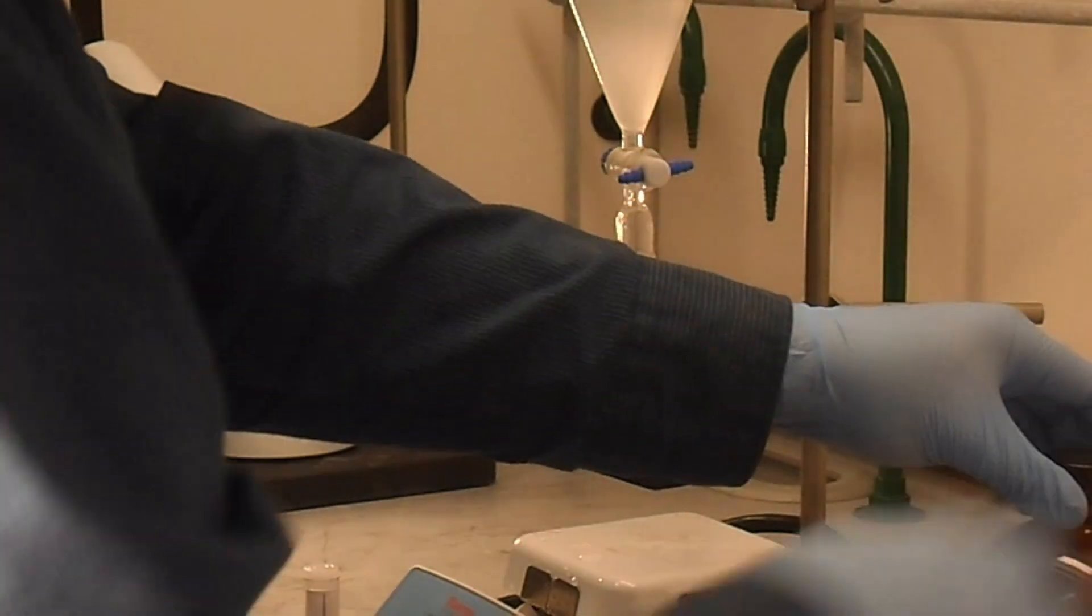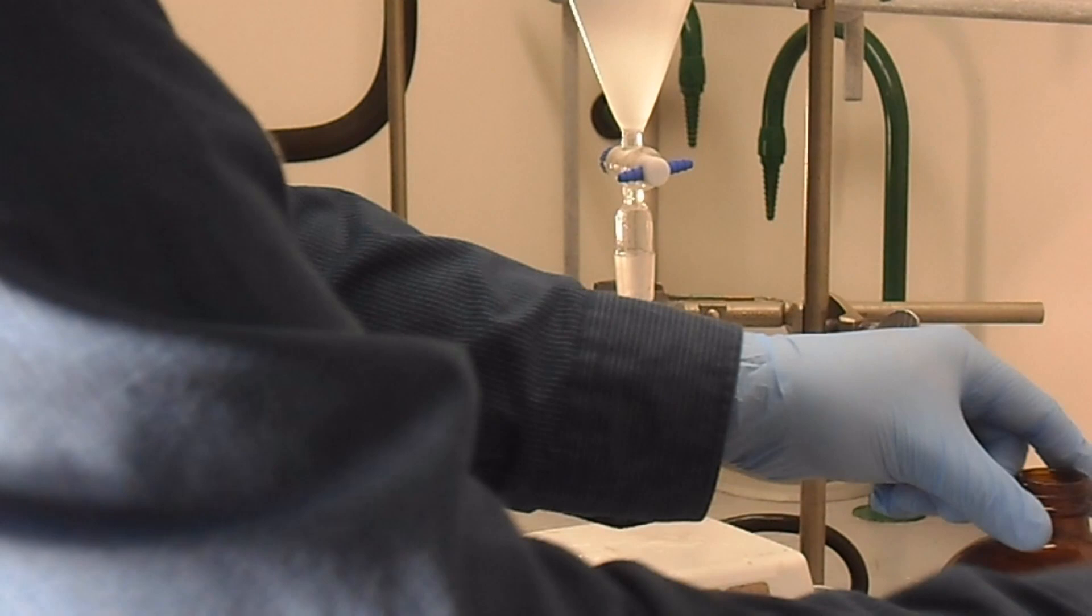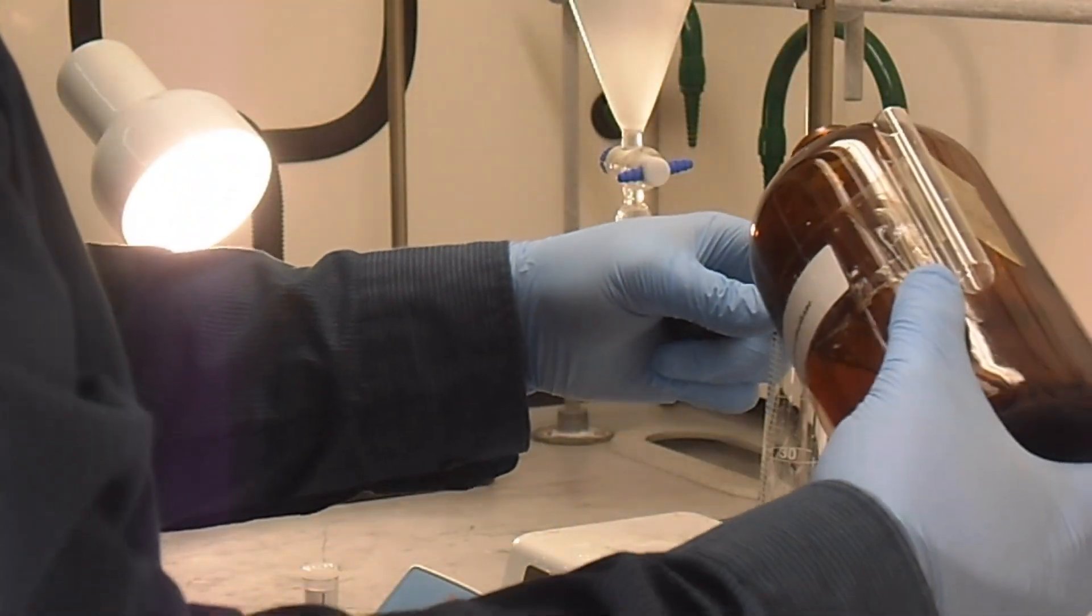Once our first extraction is complete, we have drained our DCM layer into an Erlenmeyer flask. We're going to repeat the process with another 20 milliliters of dichloromethane.